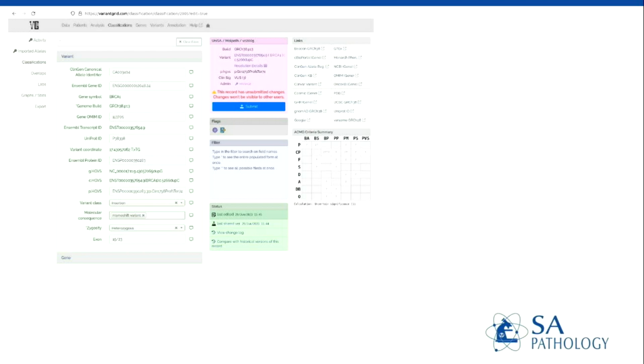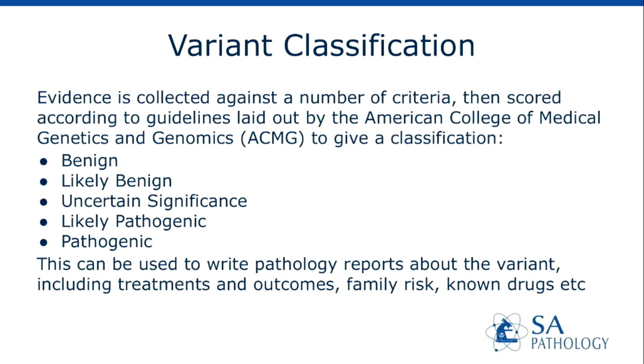Once we've found these variants, we have classification, which is the classification part of the project. We auto-populate it, but the medical scientists can also tweak it and grab information from various other sources. Some things you can't automate, like interpreting literature, well, not yet. Ultimately they follow a framework called the ACMG guidelines, and they classify a variant in one of 5 ways: benign, likely benign, uncertain, likely pathogenic, and finally pathogenic, which means definitely disease-causing. Then we send that back to the clinicians, and they can look up drugs and stuff to use.